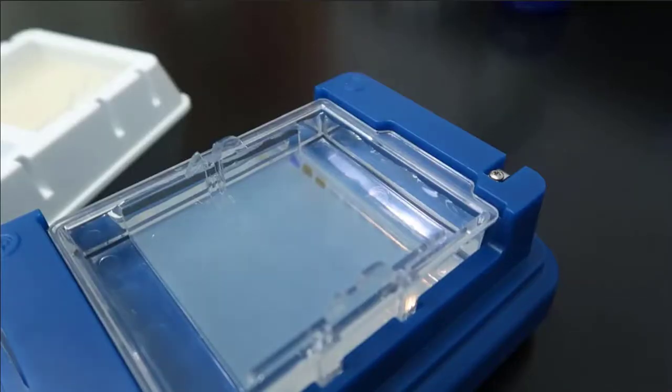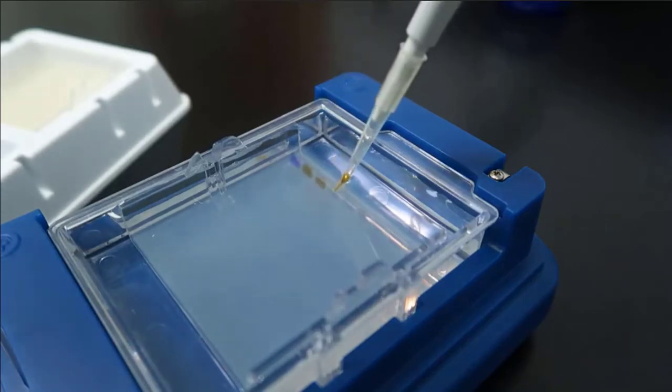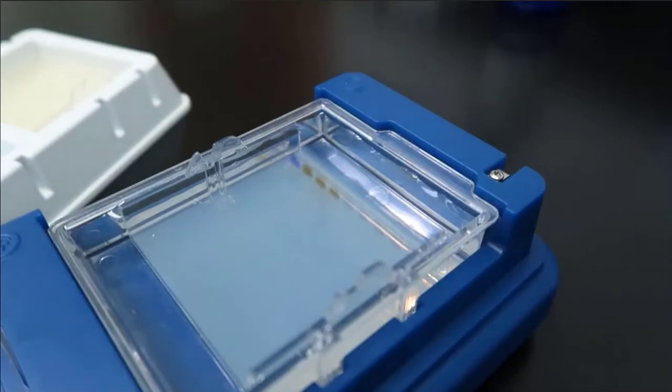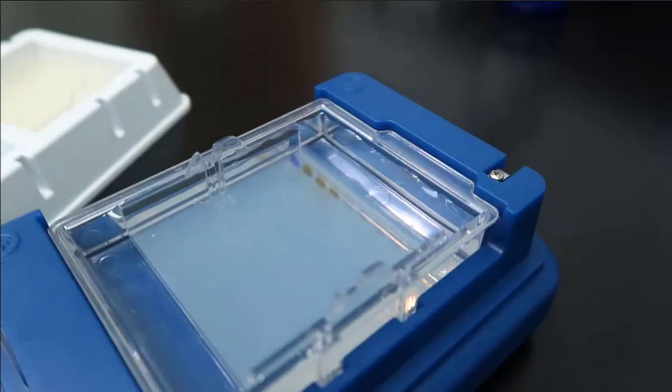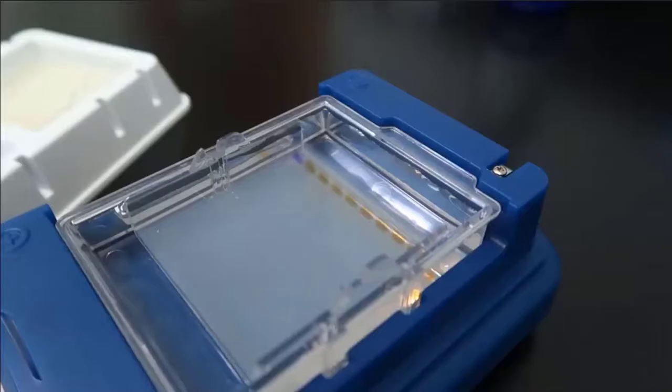When we carefully pipette the mixture into the wells at one end of the gel, the DNA will sink to the bottom. The color of the dye lets you see that your samples have been loaded properly into the wells. The dye is also negatively charged and tinted, so that we can more easily track the movement of molecules through the gel.